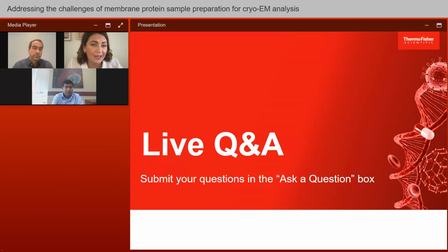I don't believe this is a real dimer or tetramer, because I don't get that same size eluted when I have the protein at a lower concentration, or in a detergent screen beforehand. It came off at a retention time that's more reminiscent of a monomer.